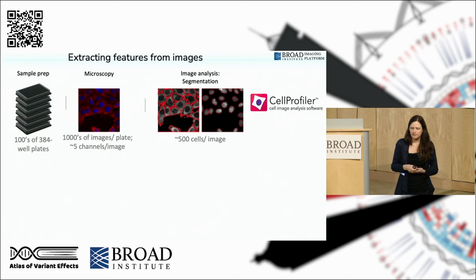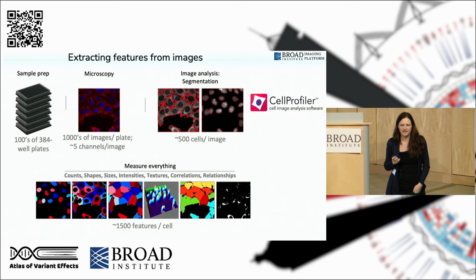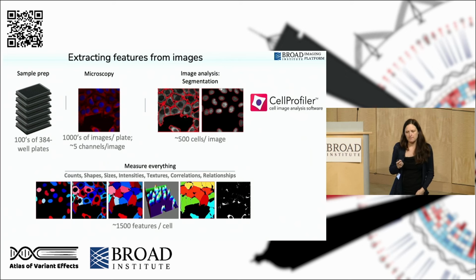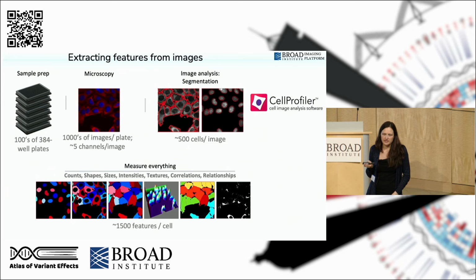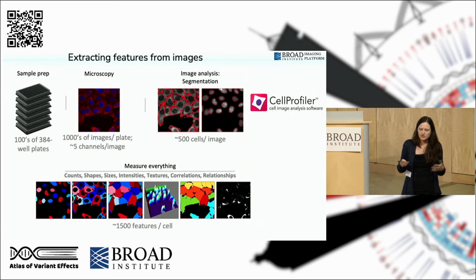In this case, it's U2OS cells. It's an osteosarcoma cancer cell line. So segmentation is not typically too hard. And then the next thing we do is we extract all the features we possibly can. Nothing here is overly complex or fancy. If I explain every feature, there's thousands of features that come out of the software, but I really can't explain every one of them to you. Some of them are based on counting, like how many speckles or how many cells are there.